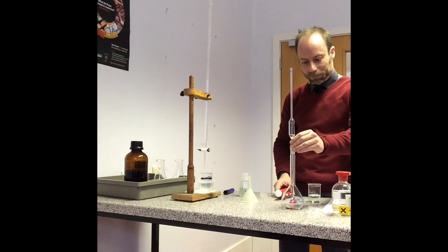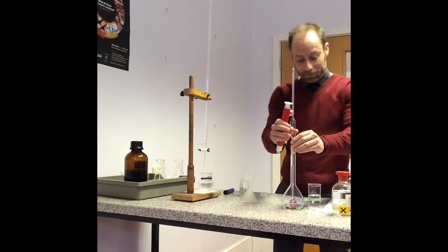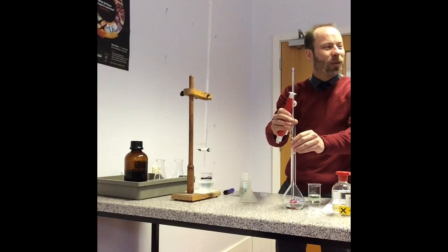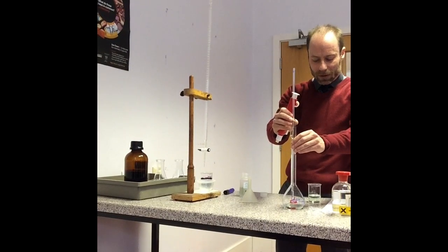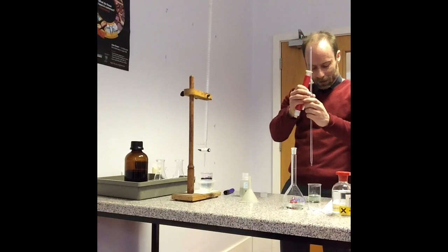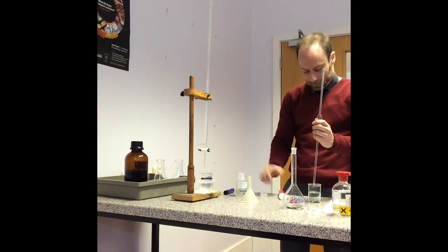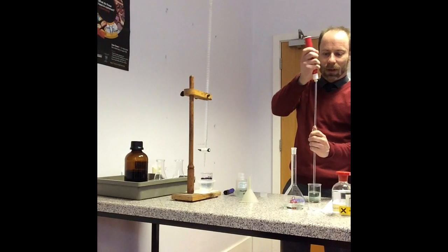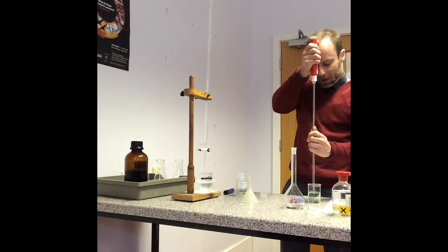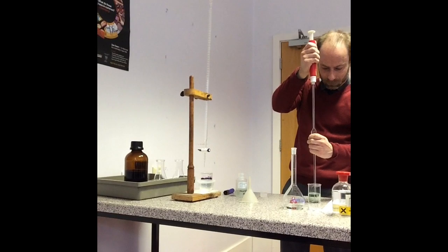Why are we using 50 instead of 25? Again, it's to get a good titre, really. It's more accurate. You want it to be a reasonable titre. Right, so that is the first 25. It's good practice for you when you do it as well. How do they wash the pipettes out? Distilled water first of all, and then with a little bit of this solution.